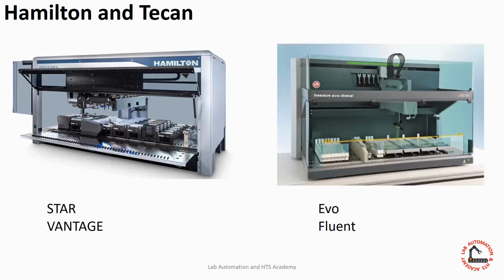Okay, so we talked about a few factors that you need to consider when you are purchasing a liquid handler for your lab. At the end of the day, everything boils down to how much money you have and what you want to do with your robot. If you answer those two questions, you can probably find a liquid handler that can make your life easier in the lab.